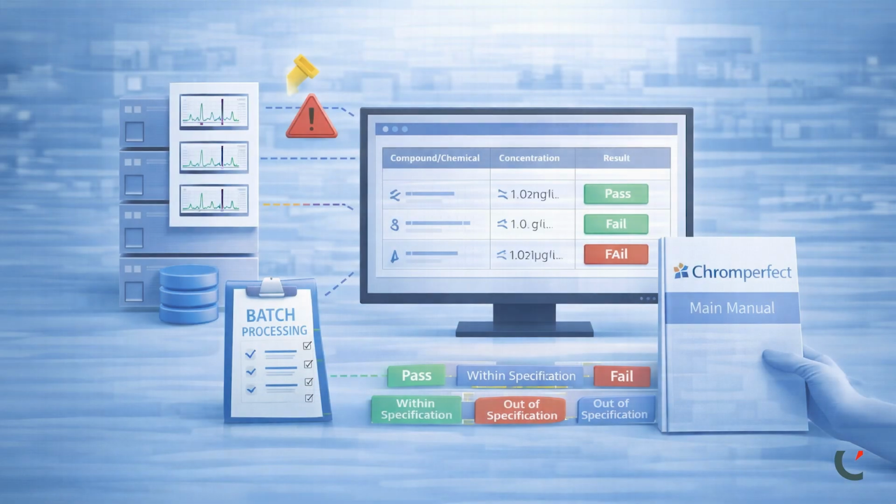To summarize, formatted reports in Chromperfect can be extended beyond simple output to support advanced workflows. Reports can be designed to include multiple channels within a single output, allowing complete representation of multi-detector instruments. They can also incorporate alarm checking, enabling automatic evaluation of results based on defined criteria. In addition, reports can be configured to interpret results using conditional logic, allowing numerical values to be translated into clear outcomes such as pass or fail, or within and out of specification, which is particularly important for applications such as certificate of analysis and environmental testing.